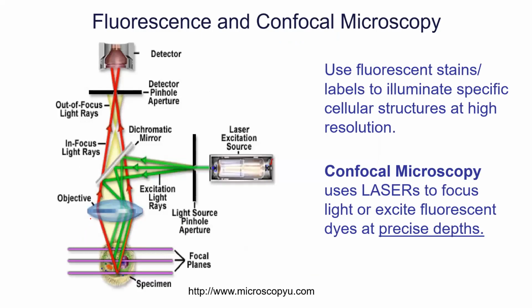Okay, moving right along, I wanted to talk about one more type of light microscopy, something a little bit more advanced, something a little bit more expensive. I mentioned that the microscopes in the Chiana lab are maybe $8,000 each. Probably in today's dollars, they're maybe $10,000 or $12,000. That's expensive, but it's affordable enough that a college can buy a handful of them. One way to improve our sample is to use fluorescence.